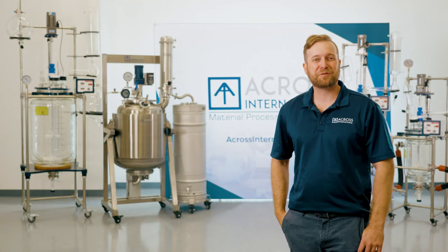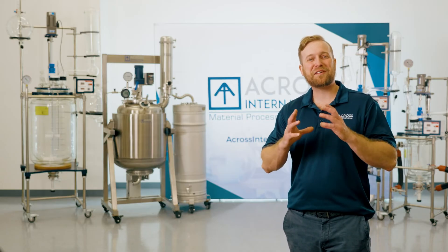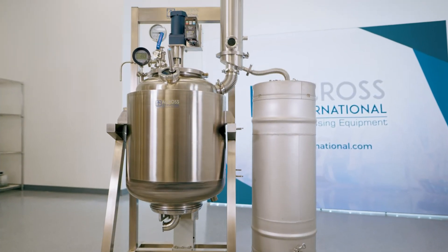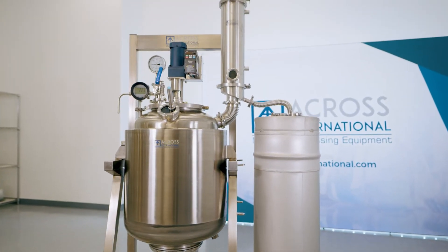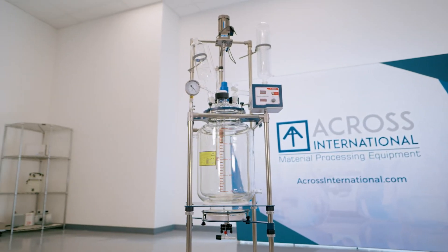Hello and welcome to the Across International Showroom. My name is Evan, Senior Applications Engineer, and today we have an exciting topic: reactors. Stainless steel reactors, glass jacketed reactors, filter reactors, non-jacketed reactors, and how they all play a part in cannabis processing.